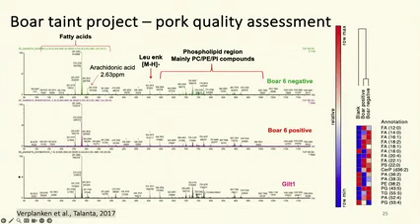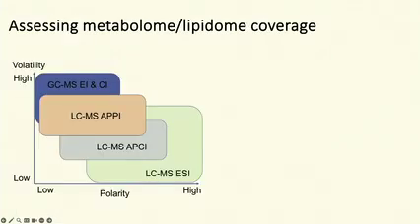We also evaluated the spectra coming from those samples, and we saw that the spectra of REIMS generated from meat are dominated by lipids and fatty acids. We also saw the same pattern within the specific molecules that are contributing to the separation between different meat samples. So we might think that REIMS is only restricted to lipid analysis, and partially it is true, because whatever ionization technique you would use, there is a certain inclination to ionize molecular species with a certain polarity.